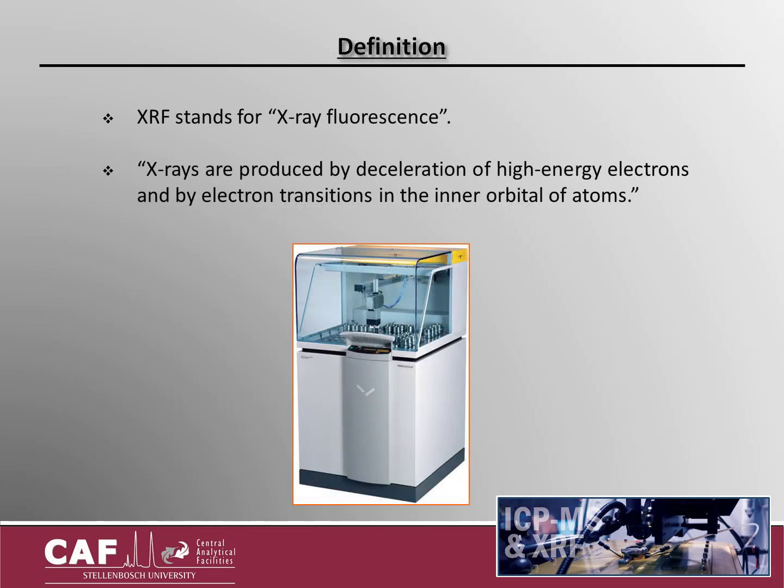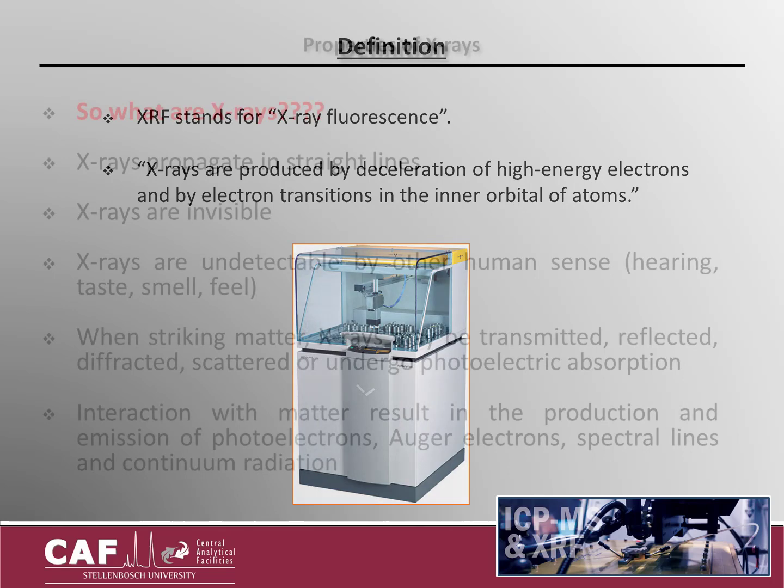XRF stands for X-ray fluorescence. Simple to state that X-rays form the core of XRF spectrometry. X-rays are produced by the deceleration of high-energy electrons and by electron transitions in the inner orbitals of atoms. So let's look at a few important properties of X-rays and review this definition.